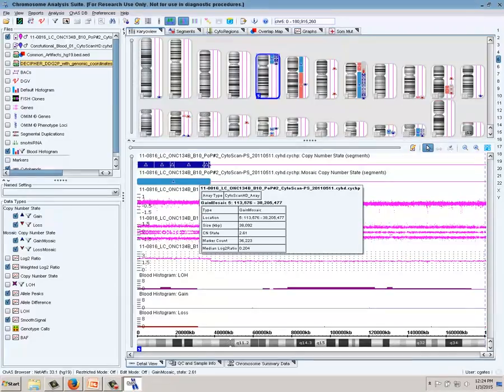That's not accurate. It would be redundant. So we wanted to come up with a way that would be easy in terms of the fewest number of clicks, but also best represent the data in the database.